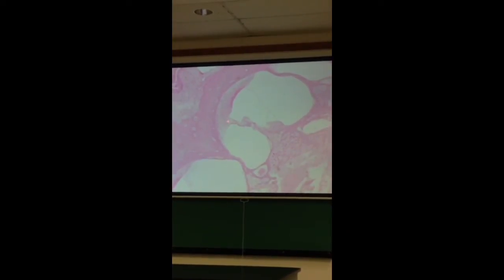The other thing to note is the other membranes. So you have the vestibular membrane separating the vestibular duct from the cochlear duct. Then you have the basilar membrane down here, the thicker membrane, dividing the tympanic duct from the cochlear duct there. And then lastly, you have the tectorial membrane, which here has been pulled up a little bit. You'll see it a little less distorted if you look around at some other ones. See the tectorial membrane? It's still sticking up on this one even.